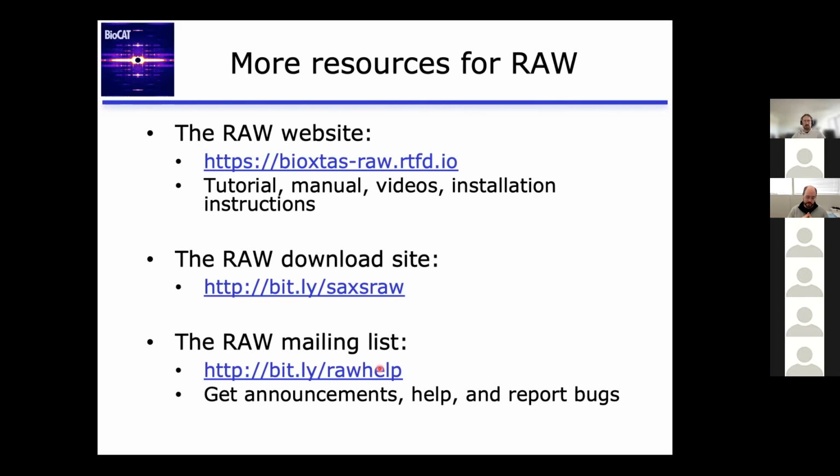If you're doing neutron scattering, so not small angle X-ray scattering, but small angle neutron scattering, there are ways you can contrast out one or the other components and get just part of the complex. And you can do that with nucleic acids and proteins or just with protein-protein complexes. For small angle X-ray scattering, it's not as easy.